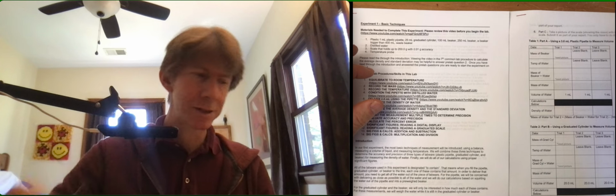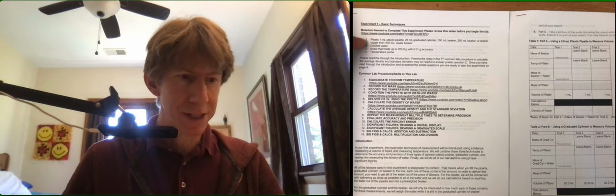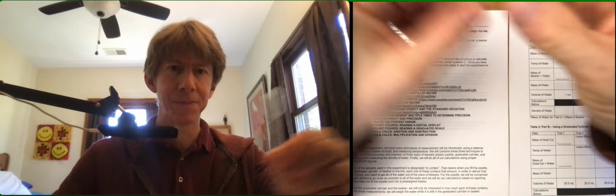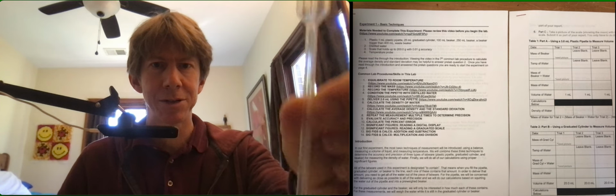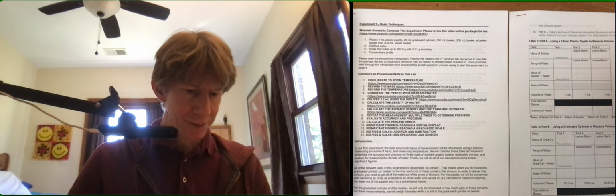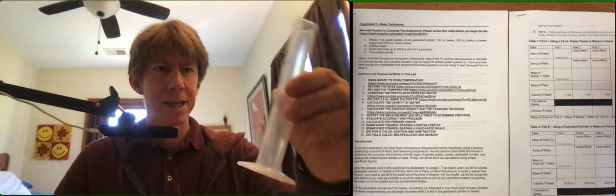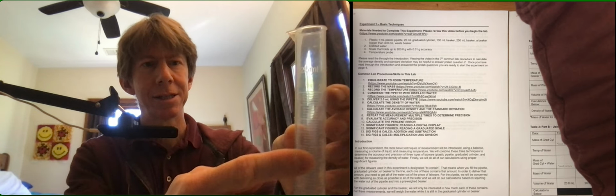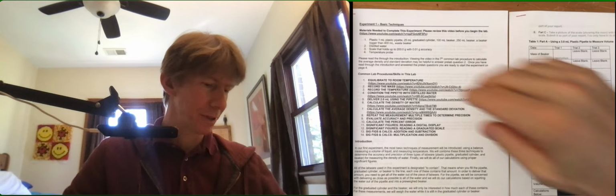I've got my favorite color pen, green. I've got a list of all the things that I need to use here. A 1 mL plastic pipette. And there we go, 1 mL plastic pipettes look like this. I've got a 25 mL graduated cylinder. And mine has writing on both sides, but I'm going to be using the permanent side, not the written side, the sort of embossed one.